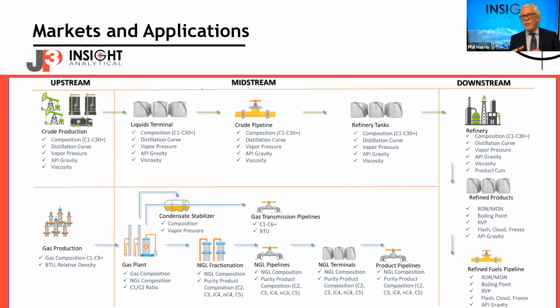And we don't have to do the interferogram side of things. With an FTIR, if you want more resolution, you usually increase your noise by adding more steps along the interferogram. Whereas with the JP3, we typically run at quite high resolution, about 0.5 nanometer steps, and if we change the resolution, it just changes the scan time a little bit.